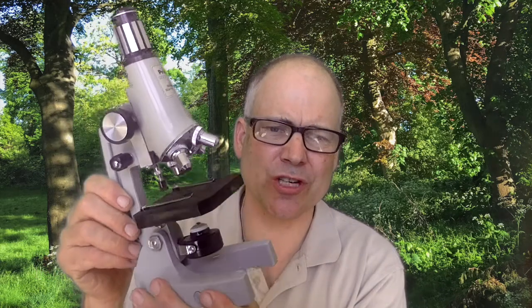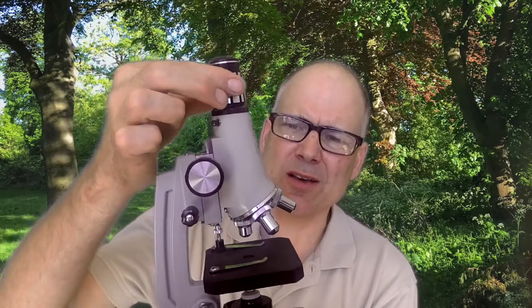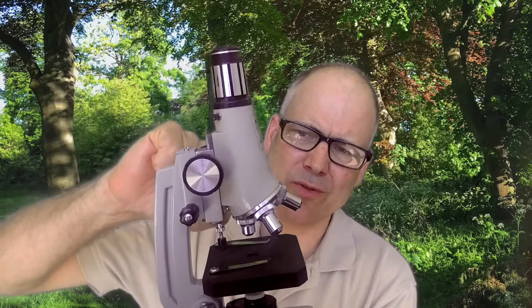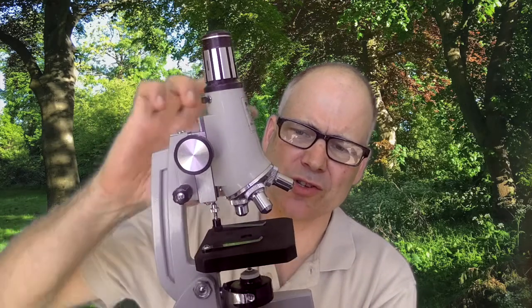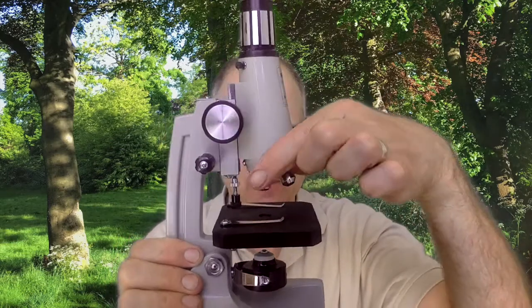Okay, so we're going to look at some samples using a microscope. But first of all, I thought, well, let's have a look at a traditional light microscope and see about the various components. So the bit that you look through at the top is the eyepiece. You look down through the main part of the microscope towards the turret, which holds the objective lenses, which are the ones that I'm twisting here.